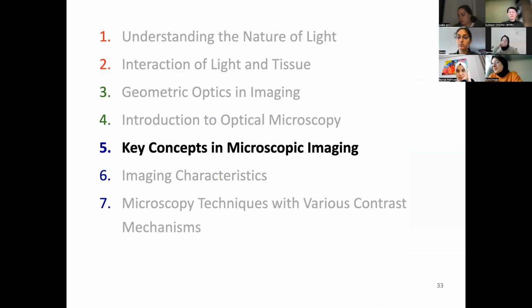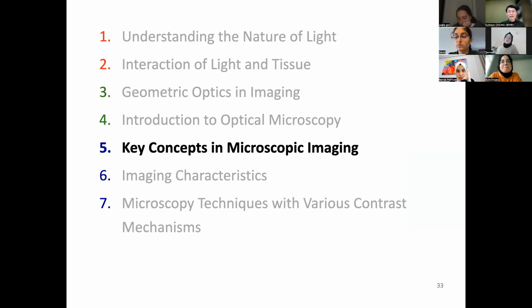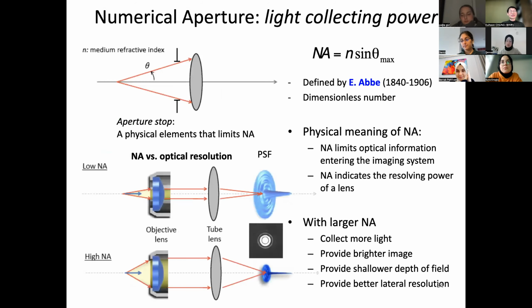Okay. So now, when you are using a microscope, you may have a question about an especially important thing, the resolution. This might be a little difficult, but I hope you understand. Then you will be able to talk about microscopy with someone else.